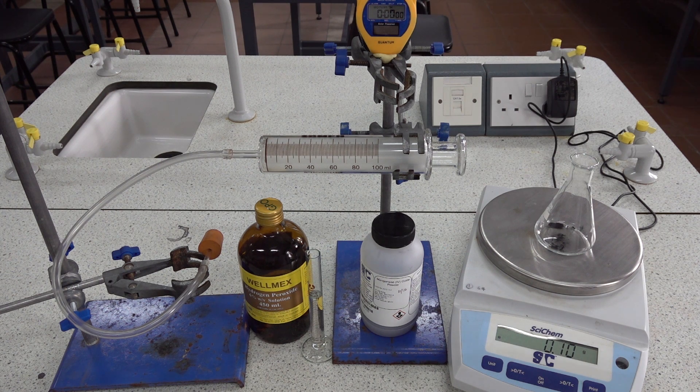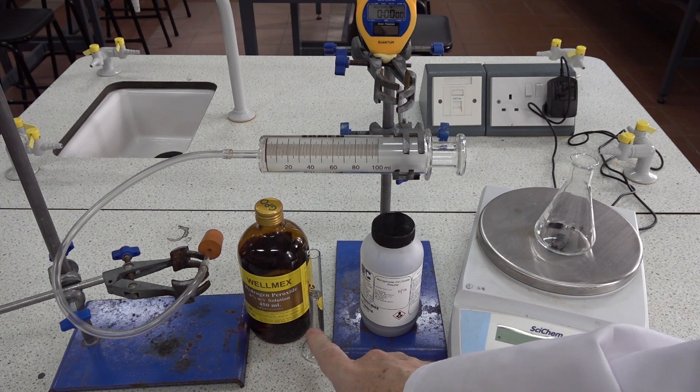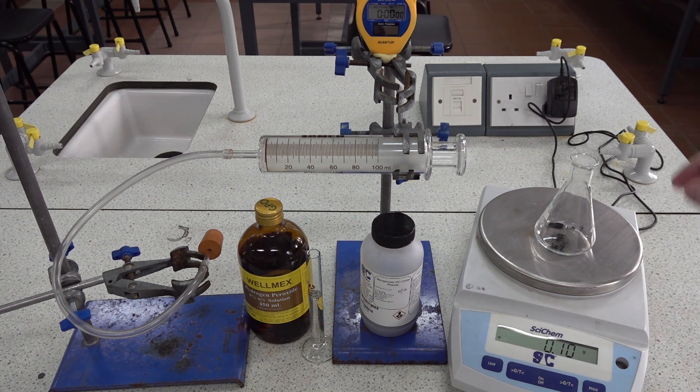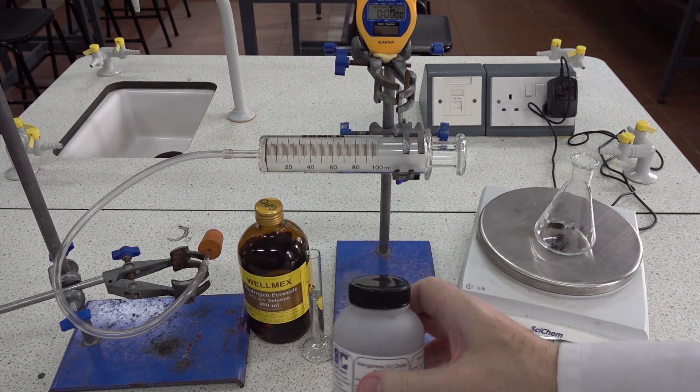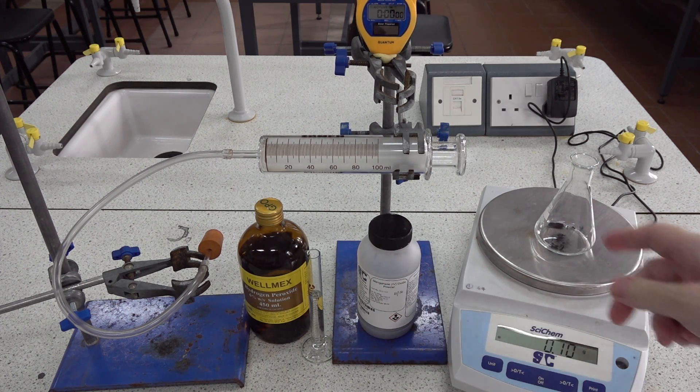Looking at catalysts for the decomposition of hydrogen peroxide. We've got 10 cm³ of 6% hydrogen peroxide in the measuring cylinder, and we've pre-weighed our first solid, which is manganese(IV) oxide, into the conical flask.